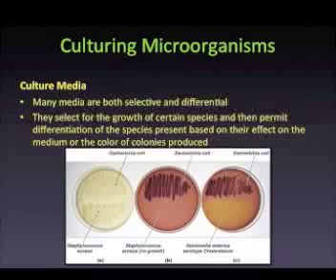The middle plate contains MacConkey agar to which both organisms were introduced. This demonstrates that MacConkey agar is selective for the growth of gram-negative bacteria. This is due to the presence of bile salts and crystal violet. The Petri plate to the right also contains MacConkey agar, with 2 gram-negative bacteria growing that can be differentiated based on their ability to ferment lactose.